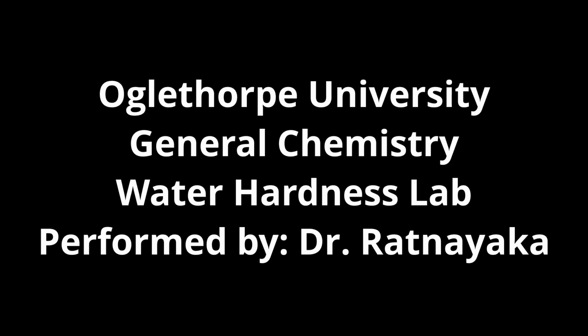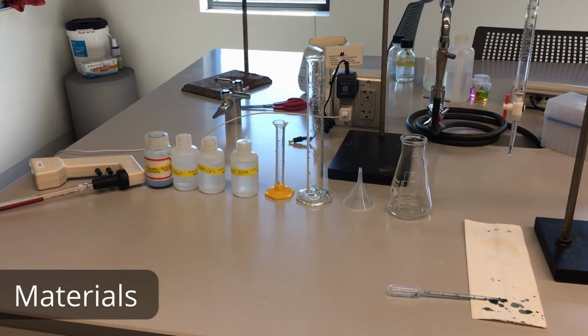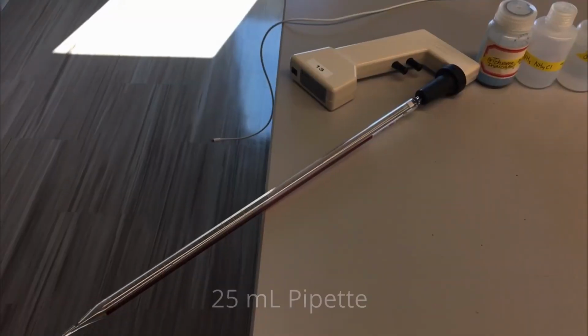Hello and welcome to the Water Hardness Lab. For this lab, we're going to test the hardness of our Georgia water here. To do that, you will use a variety of materials and chemicals to help us.